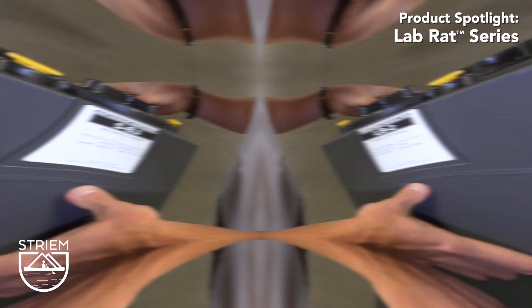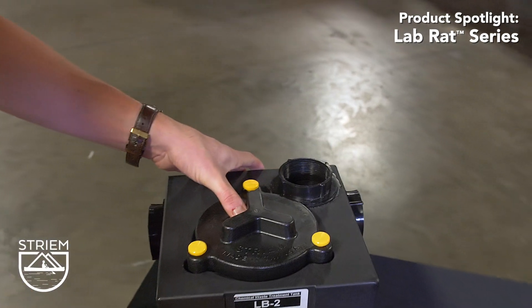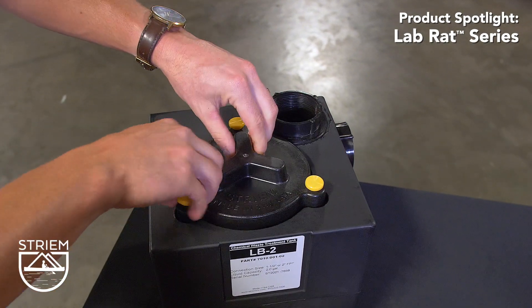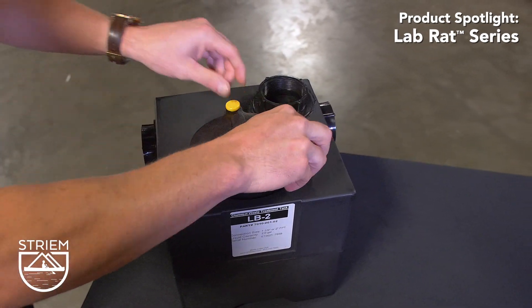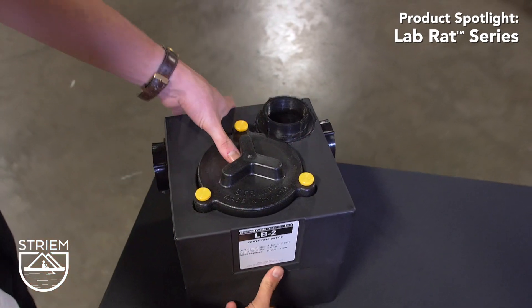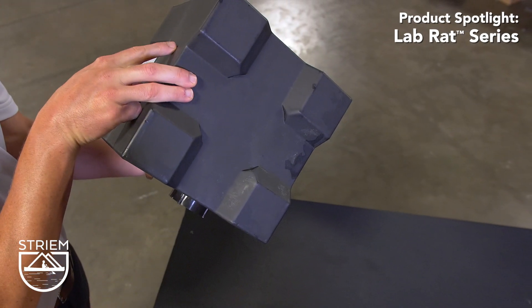To remove the cover for monitoring or maintenance, unscrew the hand-threaded captive hardware. Captive hardware means maintenance staff will never lose the bolts, helping to ensure the tank is always sealed.